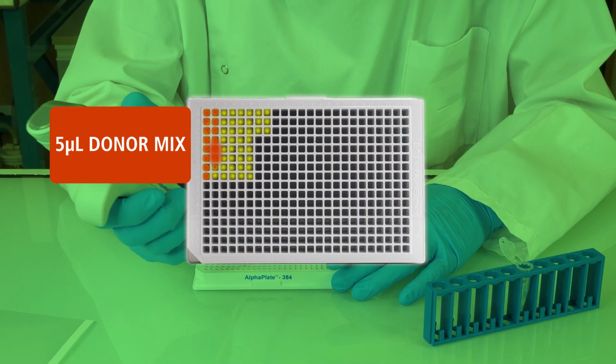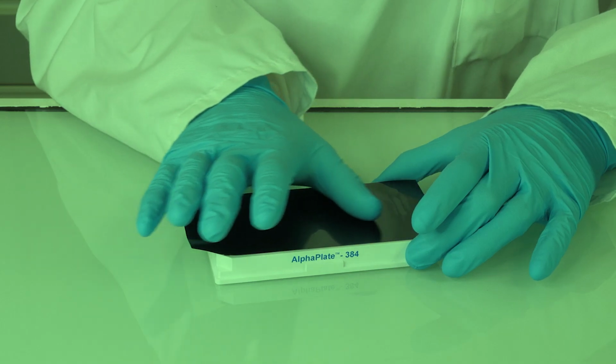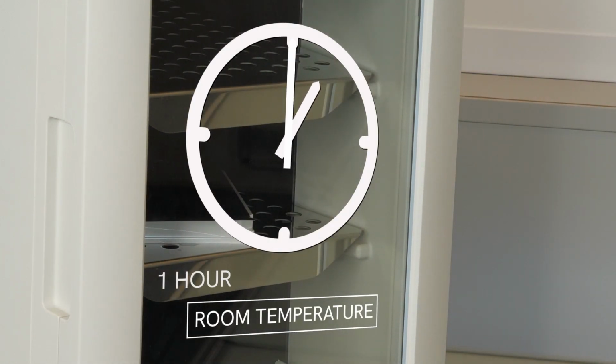Then add 5 microliters of donor mix. Seal the plate and incubate at least 1 hour at room temperature. You can now read the plate.